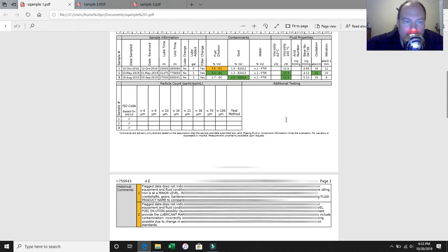Okay, so getting towards the end here. Oxidation: extreme heat, like if you have a bearing that's wearing and making a hot spot, that will cause oxidation. Also, when we talk about excessive heat, that would typically come from overheating your engine for one, but then the kind of heat that comes from component wear, like a bearing, will cause oxidation. We're going to get a real good example of that in a minute when I show you this other sample. Fuel contamination will cause oxidation. Oxidation is not a good thing. I'll show you that in a minute.